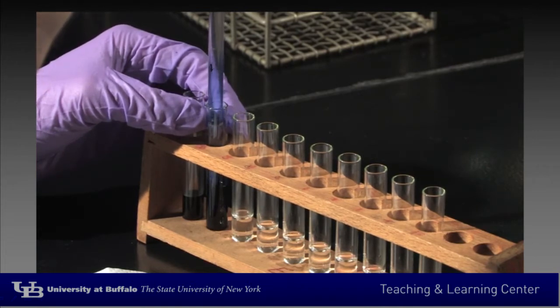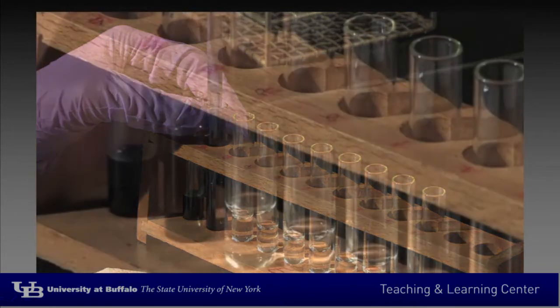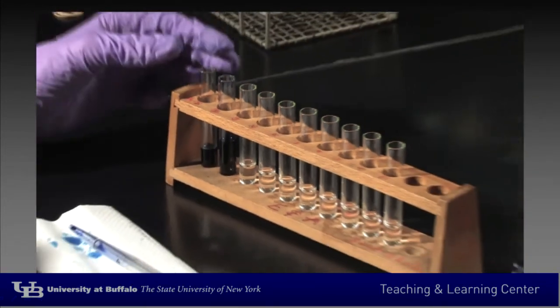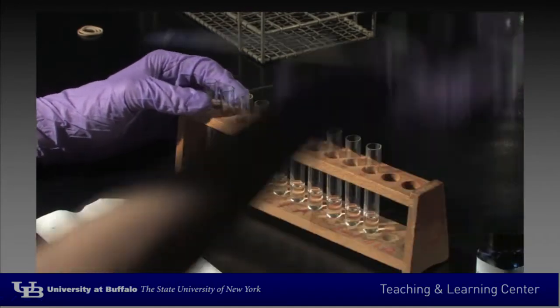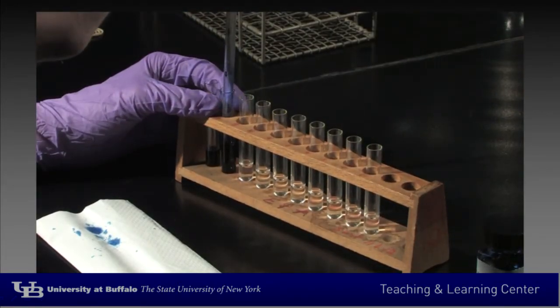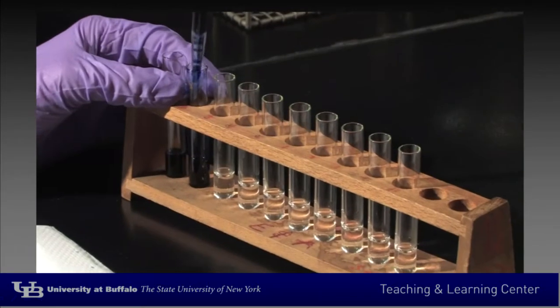Note that tube 1 contains undiluted methylene blue, whereas tube 2 has half the amount of methylene blue, since tube 2 also contains 1 ml of saline. There is 1 part of undiluted methylene blue and 1 part of saline, which equals 2 parts or 2 volumes.